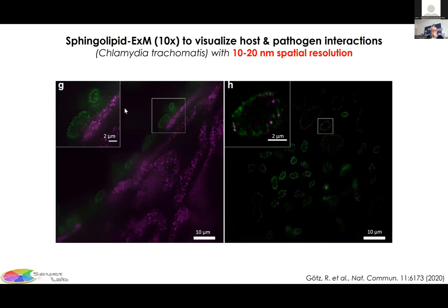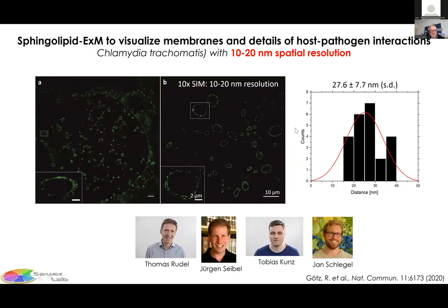of these cells. So we infected these cells with Chlamydia bacteria, and they are then visualized inside of the cell here in green, because this ceramide also inserts into the bacterial membrane. And in magenta, we have these mitochondrial proteins. So we see here mitochondria. And from time to time, we see these contact sites between these intracellular bacteria and the mitochondrial protein. And we see even an uptake of these mitochondrial proteins into the double membrane of this gram-negative Chlamydia bacteria here. Tenfold expansion, structured illumination microscopy.